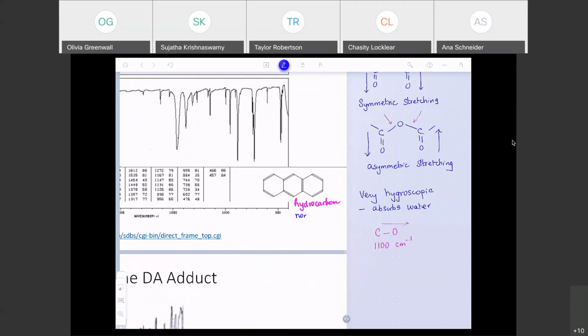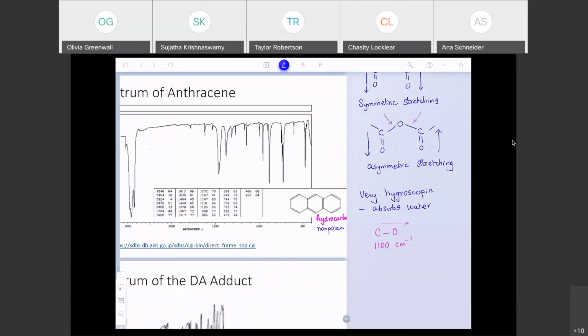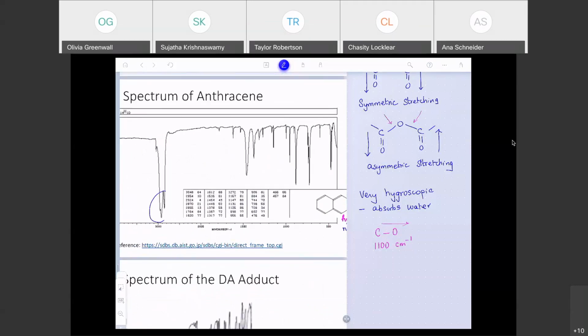Non-polar, because it has some double bonds, but nothing like carbon-oxygen. So IR is typically not very useful, which is exactly what it is. The bands you're going to explain are only this: approximately 2,900 wave numbers to 3,000 wave numbers. Those are your carbon-hydrogen stretch.